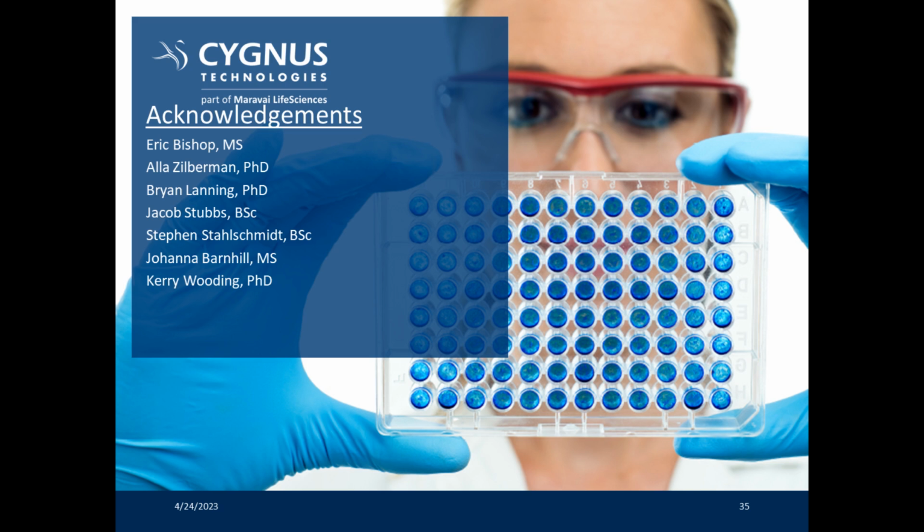So in that case, you could go 2 ways. The first way is, if it's a generic antibody, a platform antibody, you should think about going into a custom antibody, which Cygnus can develop, and that may increase your coverage of those proteins that are missed by the platform antibody. The second thing is, if you have mass spec data, you can identify what those host cell proteins are, and then you could do a risk analysis. Are these proteins on the top 40 list? Are they potentially problematic? Then you could do a risk analysis and go from there.